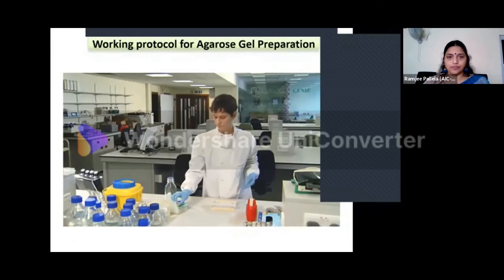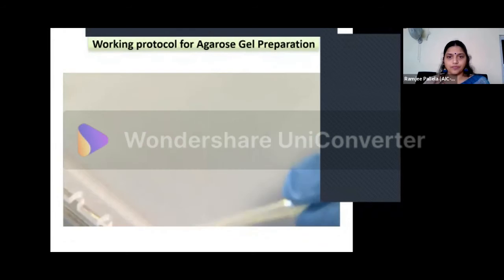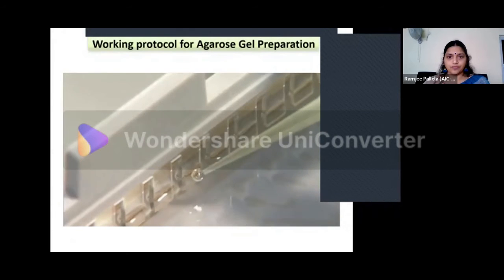Using a disposable pipette tip, move any air bubbles to the edge of the gel. It's especially important to remove bubbles from around the comb since these can affect the shape of the wells.